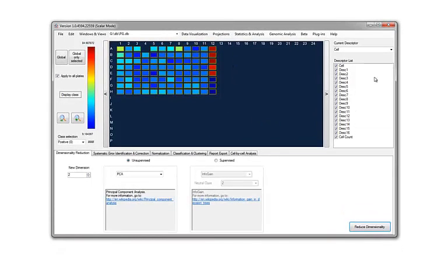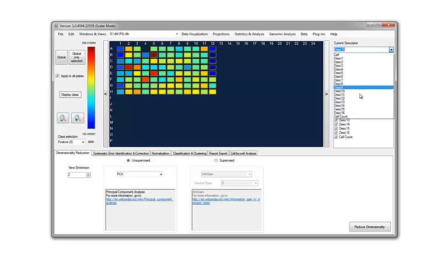And now you can see that you have all the descriptors that we checked previously, plus 1, which is the cell count. So we can directly take a look at the cell count, or take a look at all the different descriptors as usual. I will come back in the next tutorial on how to look at and display data generated by such a data import.